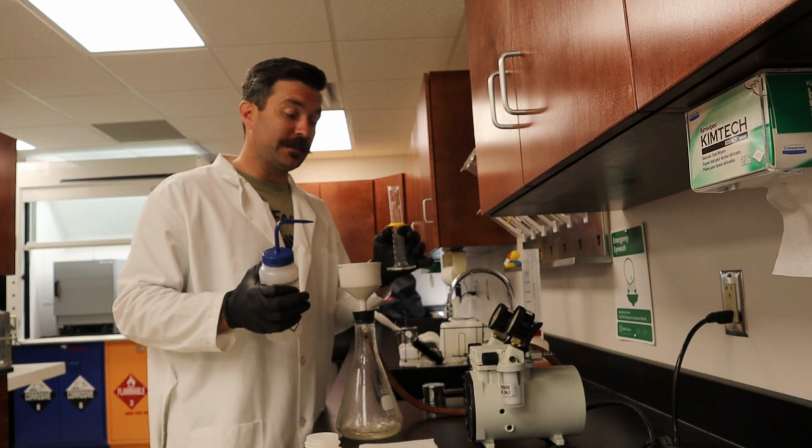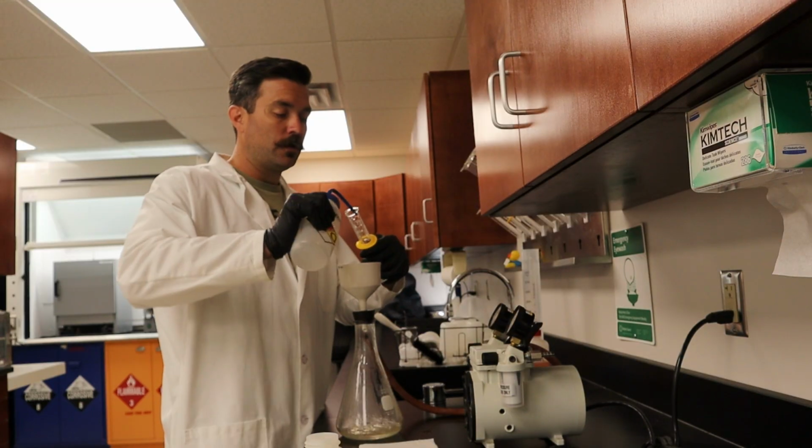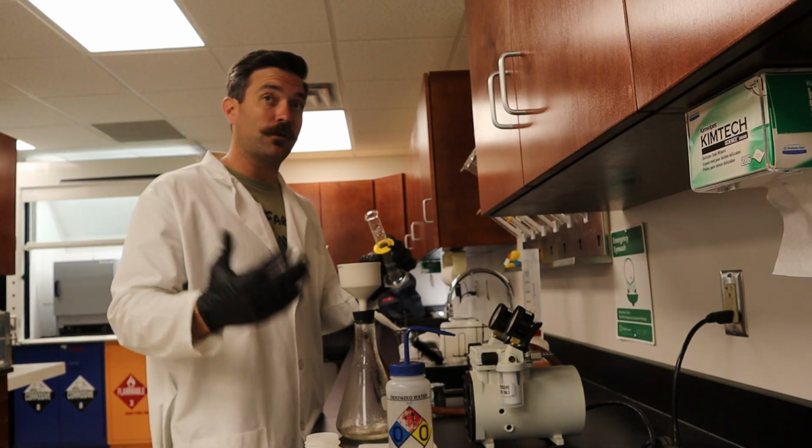Again, while I'm doing this, I'm not just dousing it with water. I'm pouring it slow. I don't want to overrun that filter and cause solids to pour over it, because then that's not going to be an accurate representation.